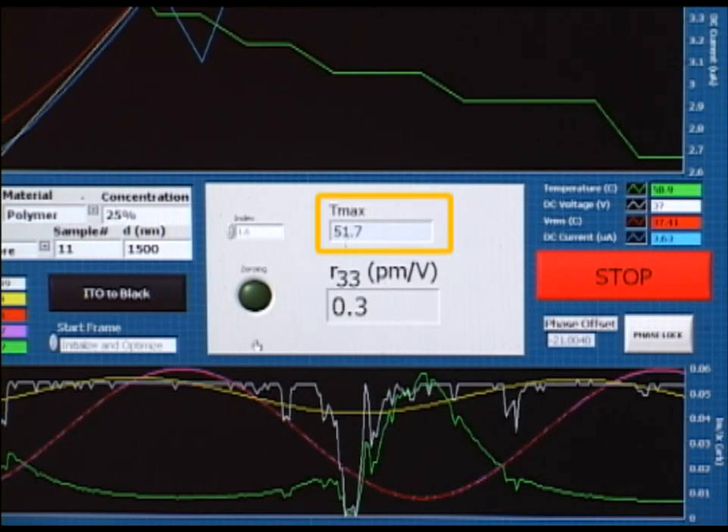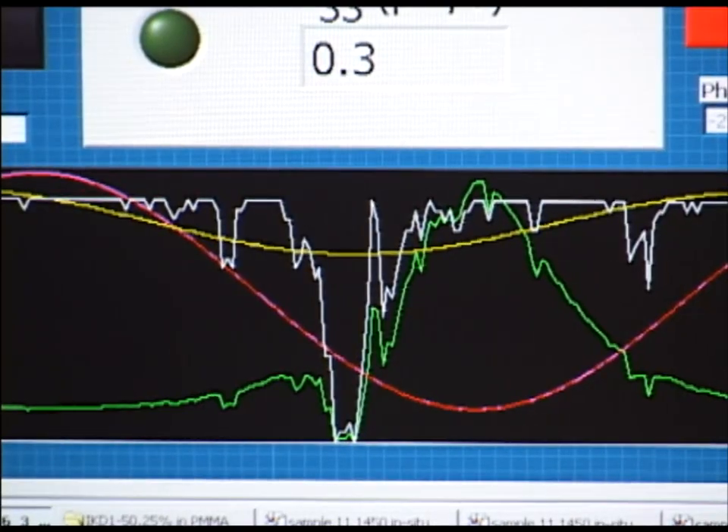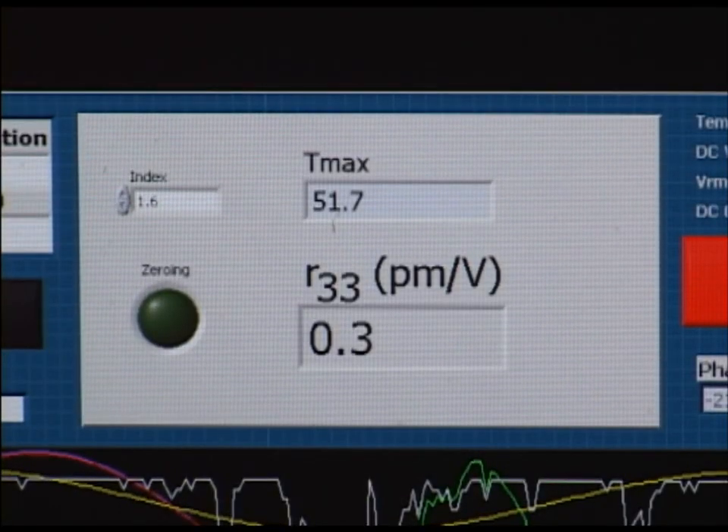The maximum temperature reached during the poling process is also reported just above the R33. This particular sample did not effectively poll. Consequently it reports a very low R33 of 0.3 picometers per volt. This is also demonstrated by the small amplitude of the I sub M fit, which is the yellow line in the lower graph. An appreciable value for R33 would be somewhere near 150 picometers per volt. It is important to monitor both the electrical and optical signal during poling so that we can more accurately determine the appropriate set point temperature or Tg temperature for the sample we are using. By doing this we can more efficiently and more reliably poll.